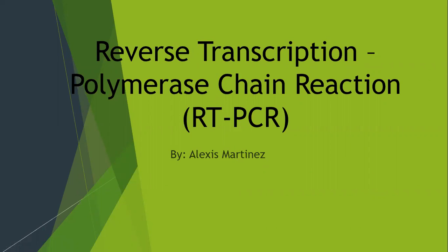I'm going to be talking about the technique referred to as reverse transcription polymerase chain reaction, or RT-PCR for short. FYI, I will refer to this technique as RT-PCR throughout this presentation.